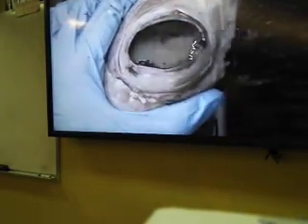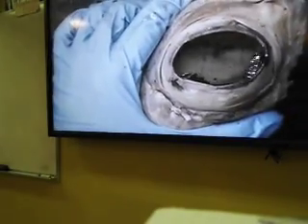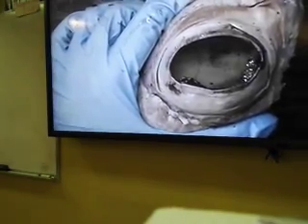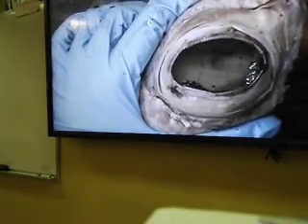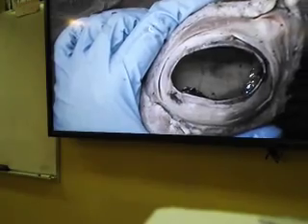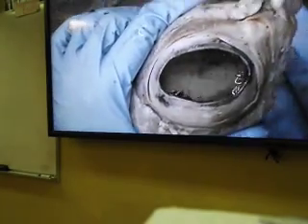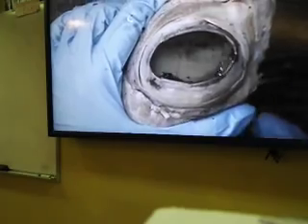And that beige color structure, which we go to when we go to the inner layer, is actually the retina, which has the receptors for the special sense of vision. It has photoreceptor cells stimulated by light, as well as two layers of sensory neurons, and one of those sensory neuron layers, which we call ganglion cell neurons, will converge into the optic nerve.